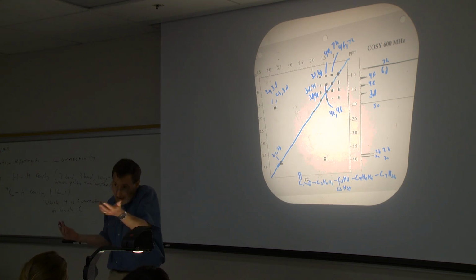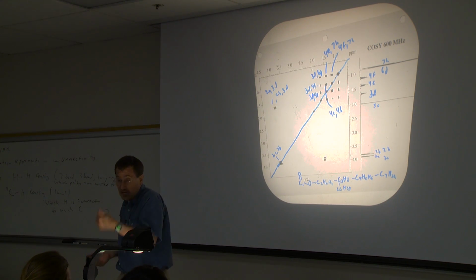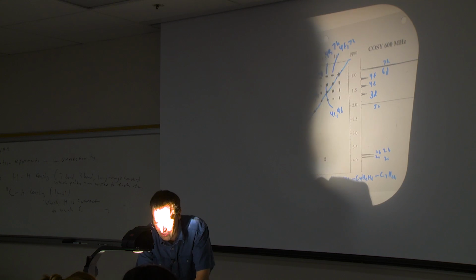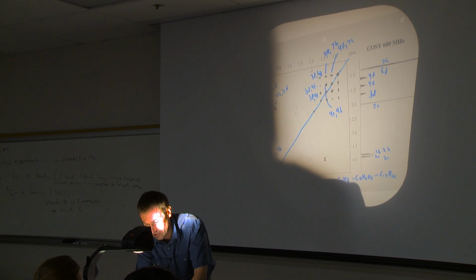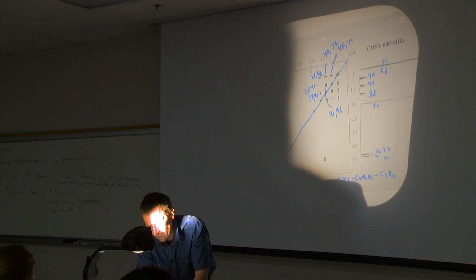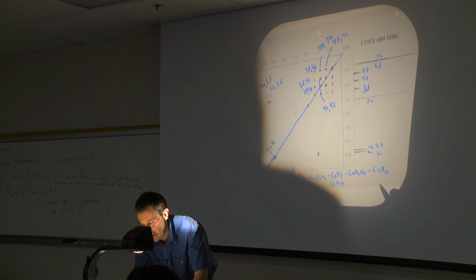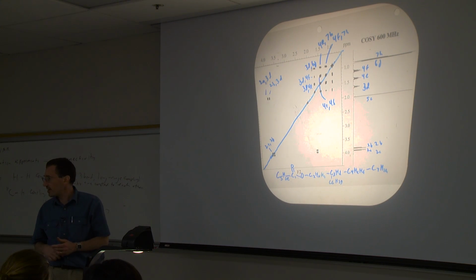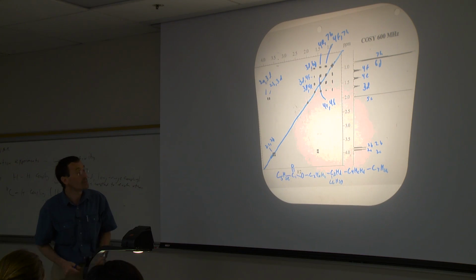On a benzene ring, probably, except we don't have a benzene ring. On a double bond, probably, except we don't have a double bond. Or on a carbonyl group. In other words, we finish our construction, C5H3E. There is our molecule. There is our ester. There is our C7H14O2 molecule.